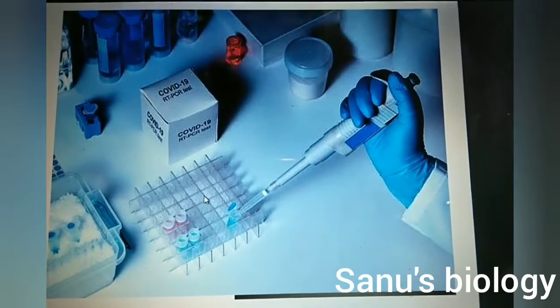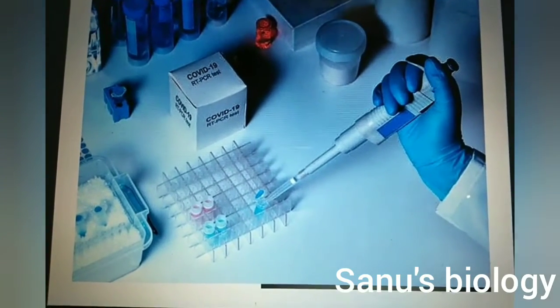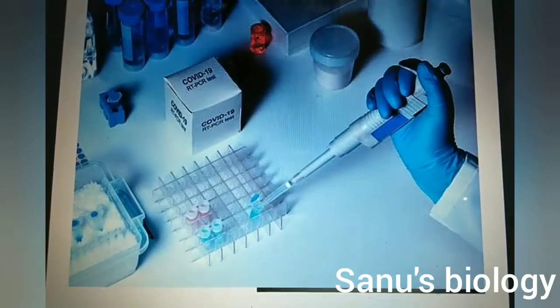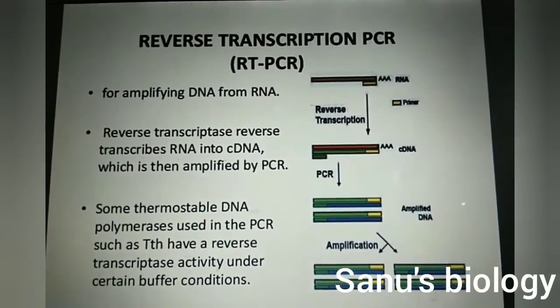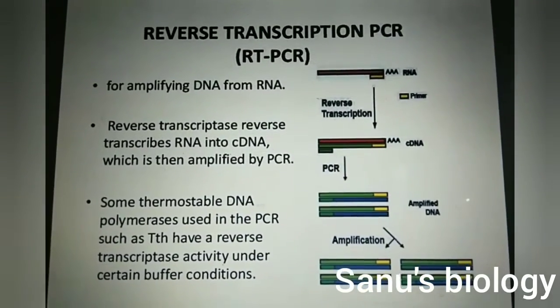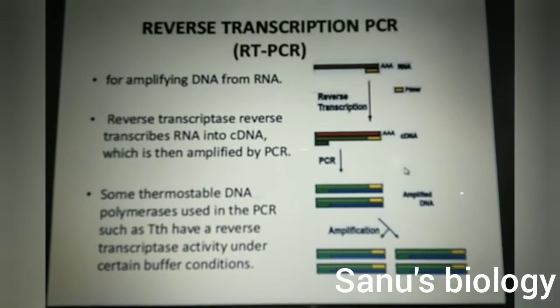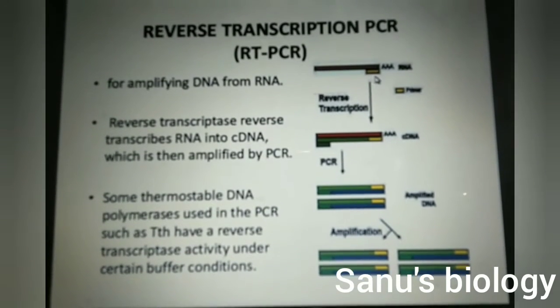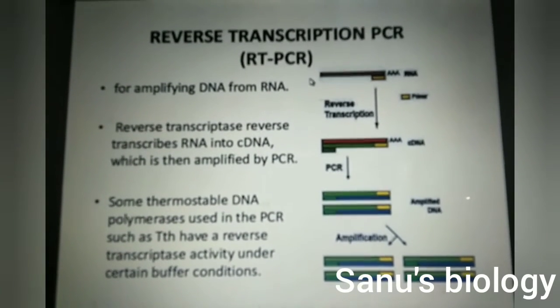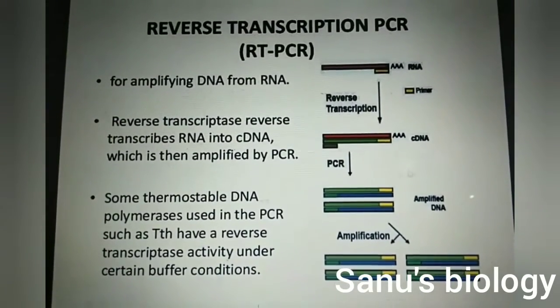For RT-PCR we need some primers. These primers are short nucleotides, and different primers are present. Reverse transcription PCR has a different principle: there are some small, short nucleotide primers which are known, and these help to extend the mRNA, and from this we get the cDNA.